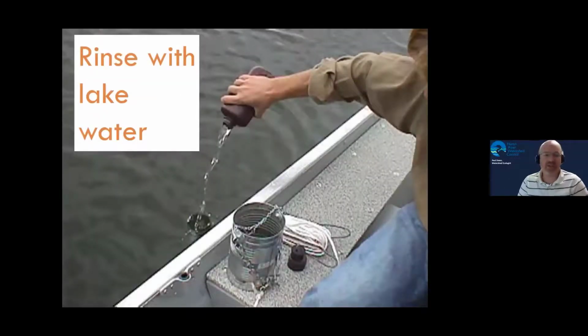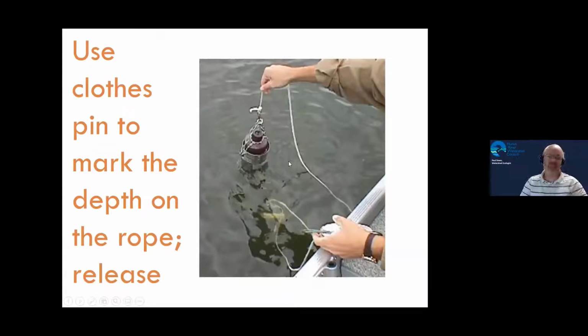Okay, so the first thing, after you figure out your Secchi and your integrated depth, is to disassemble your sampler. And this is the point where people lose their weights. So notice how awfully close he is to the edge there with his sampler. Don't bump your thigh and knock it right off, right? So you may want to be a little more careful than that. But what you're doing is filling up your amber bottle and rinsing it a couple of times with lake water to make sure that you only have lake water in there and nothing else. Okay, then you're going to reassemble your sampler.